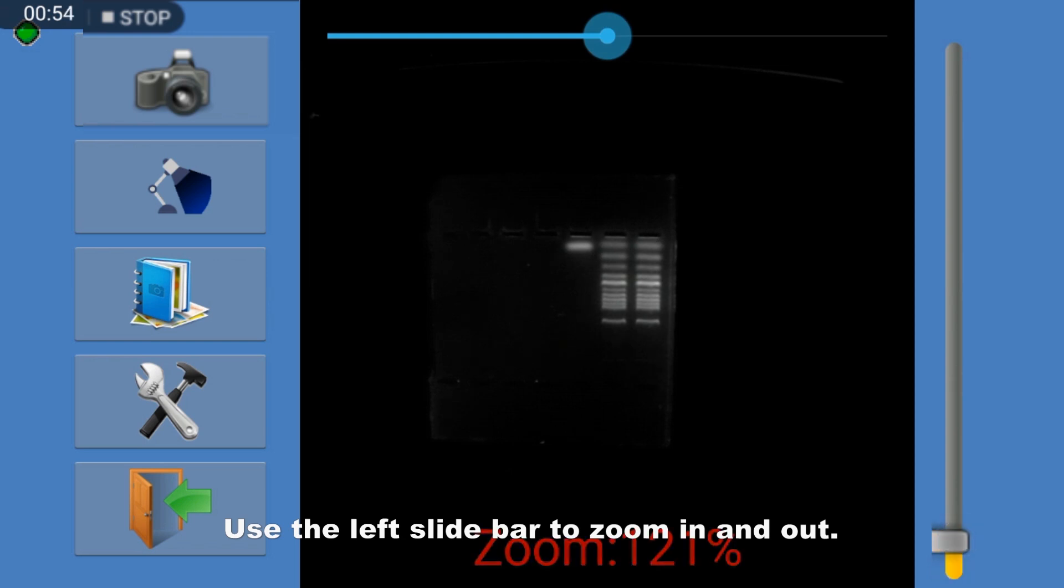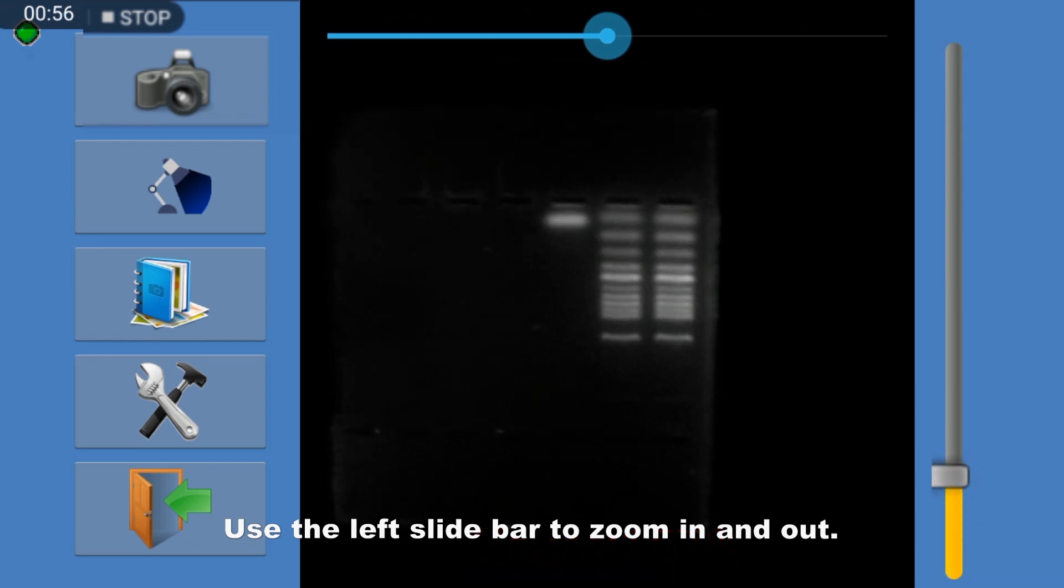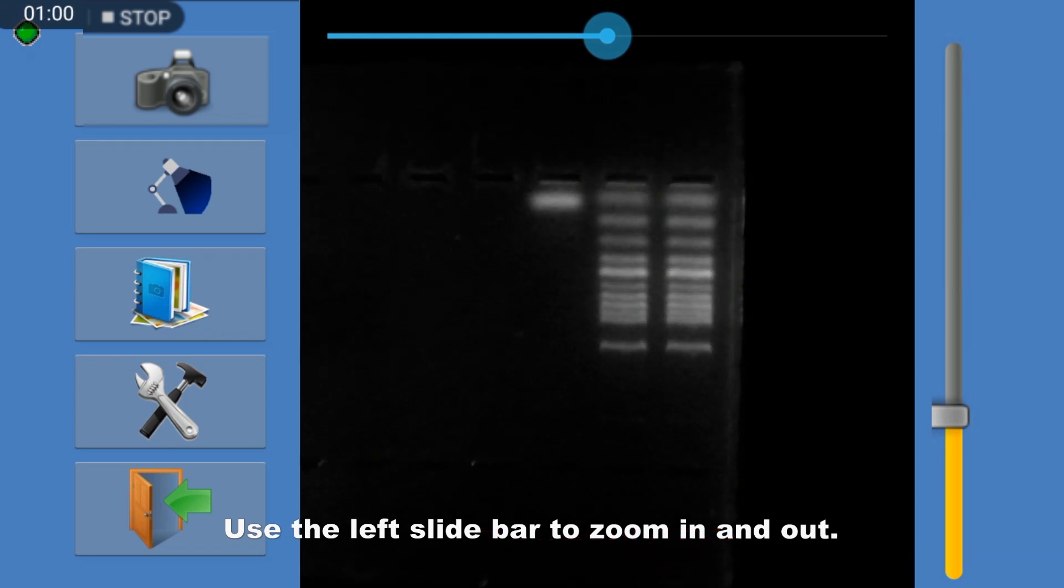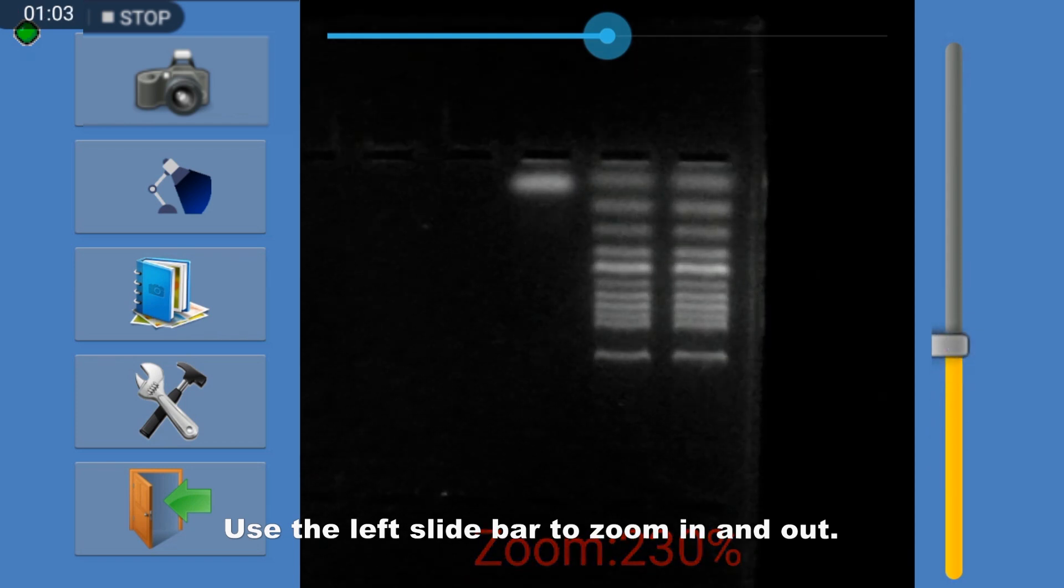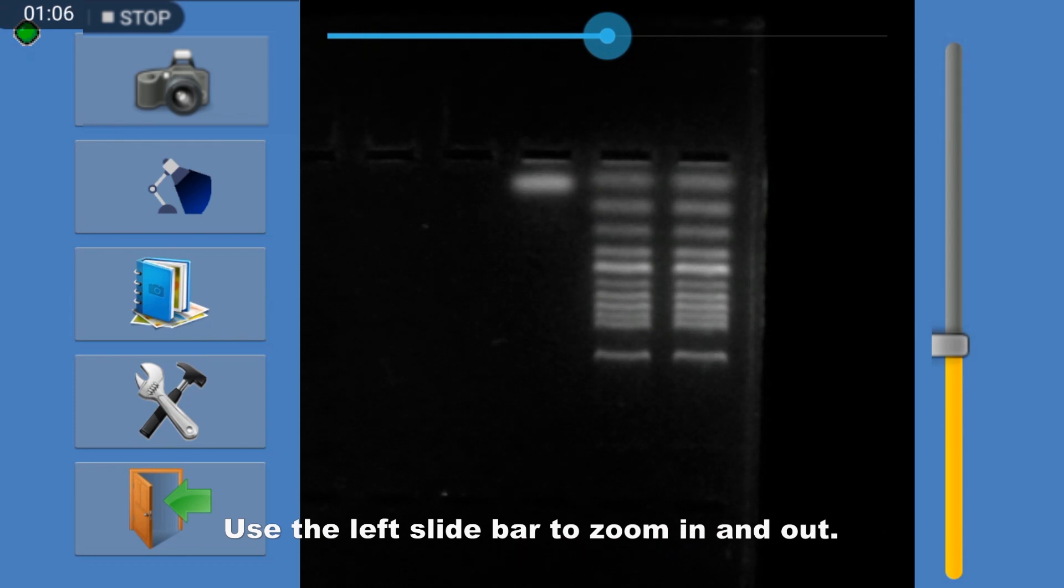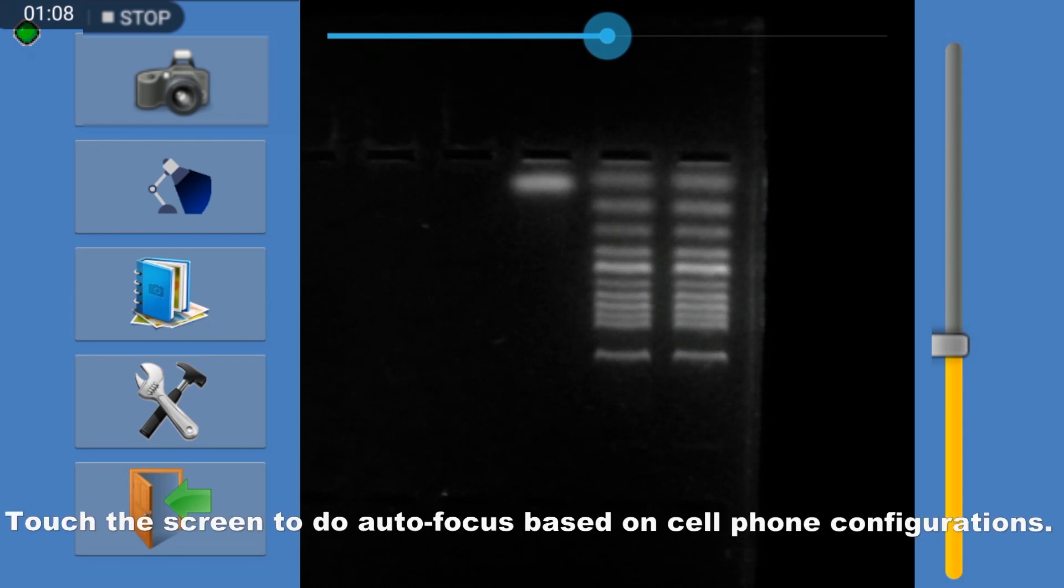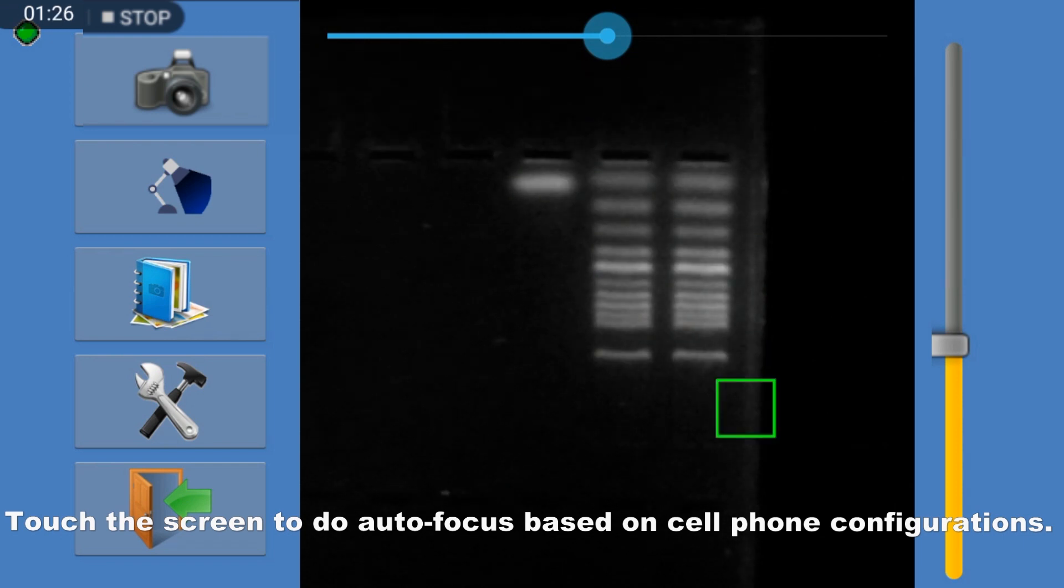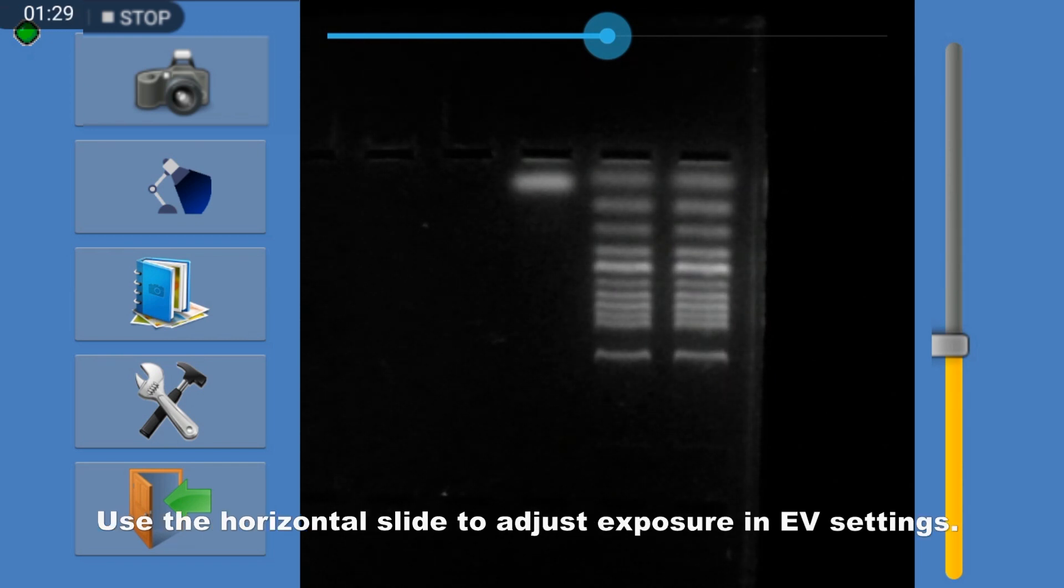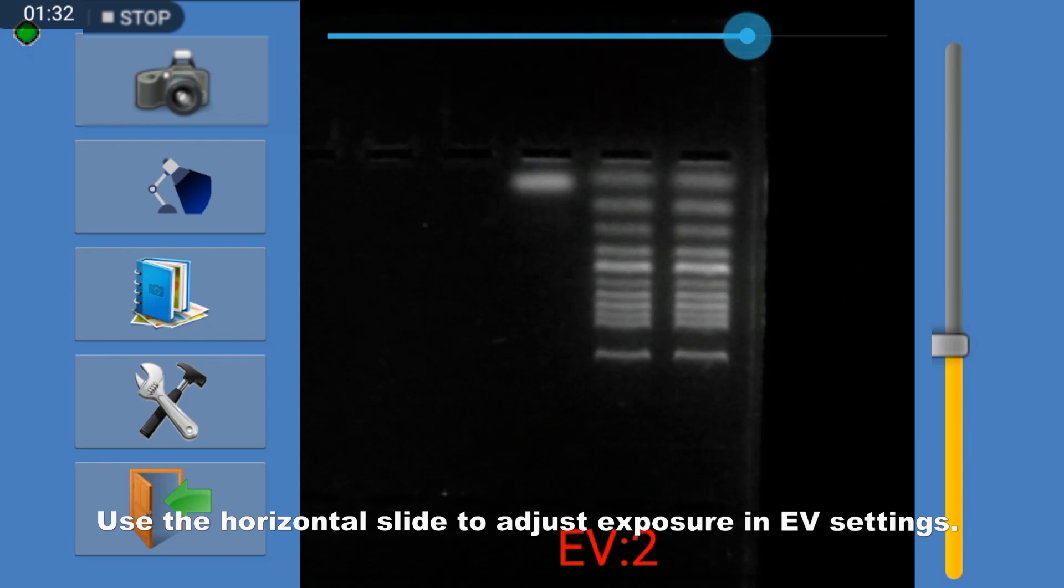Use the left slide bar to zoom in and out. Touch the screen to autofocus based on cell phone configurations. Use the horizontal slide to adjust exposure in app settings.